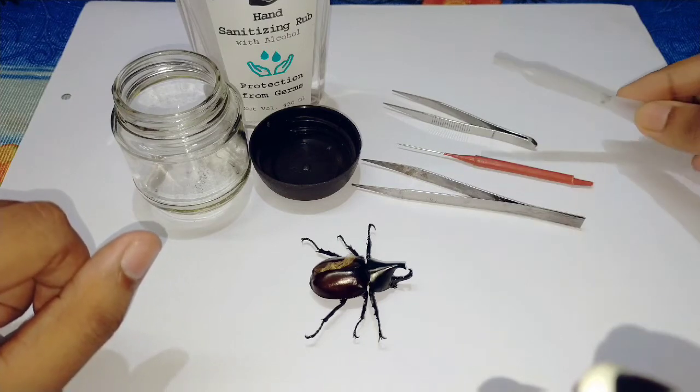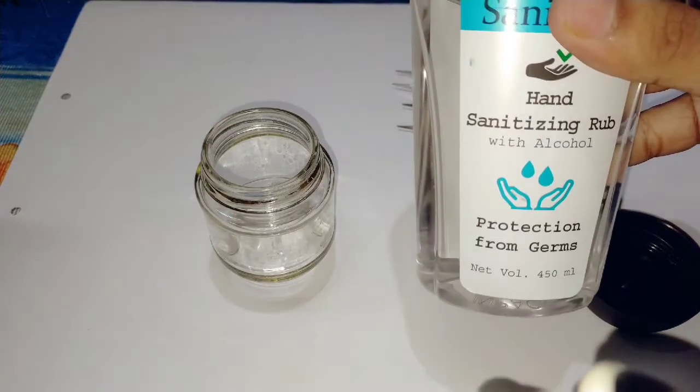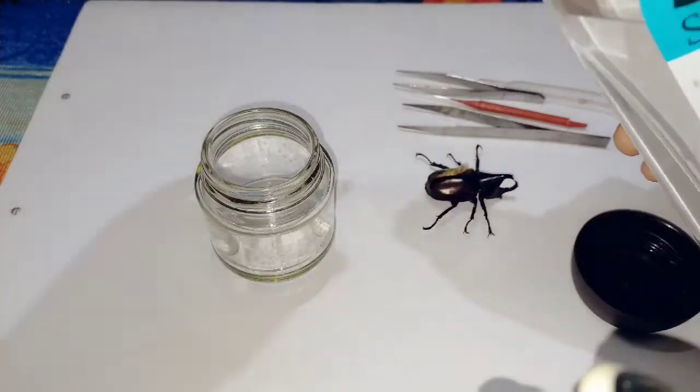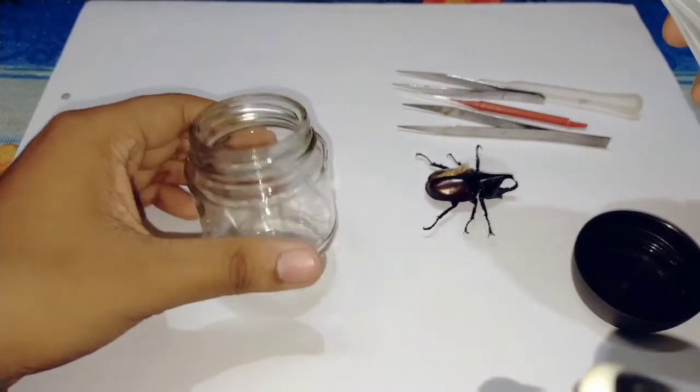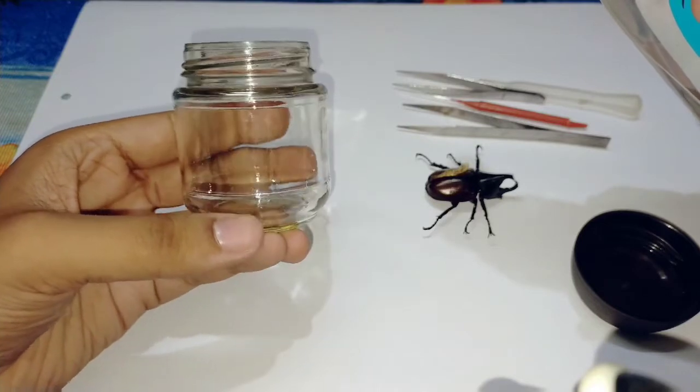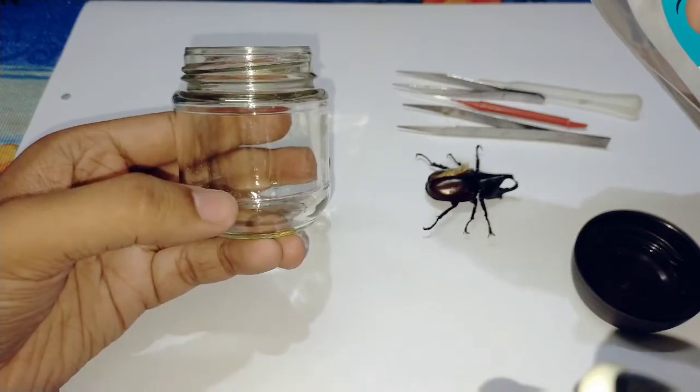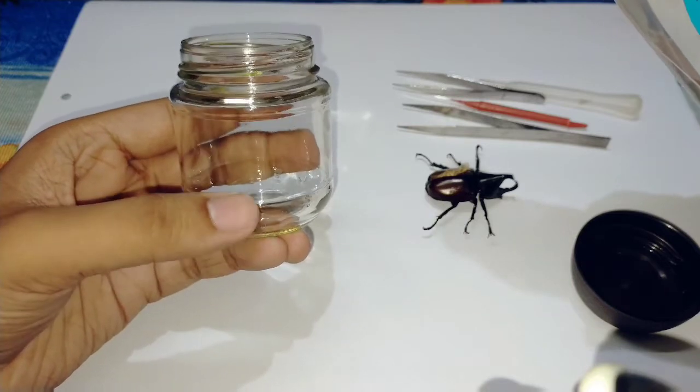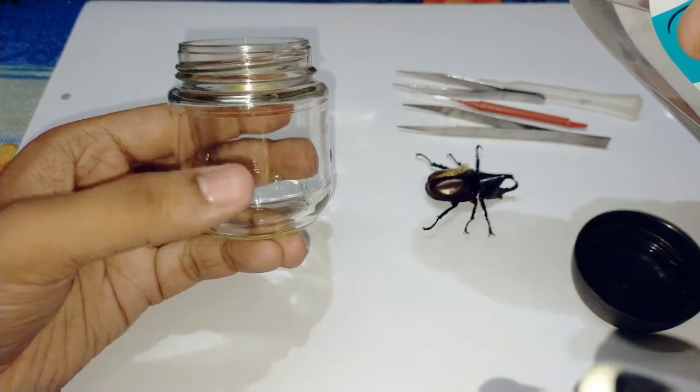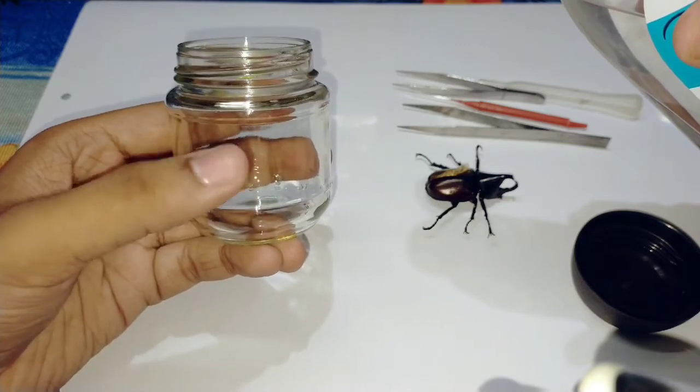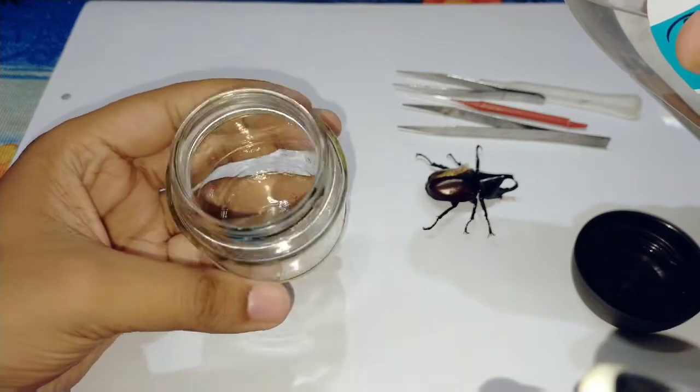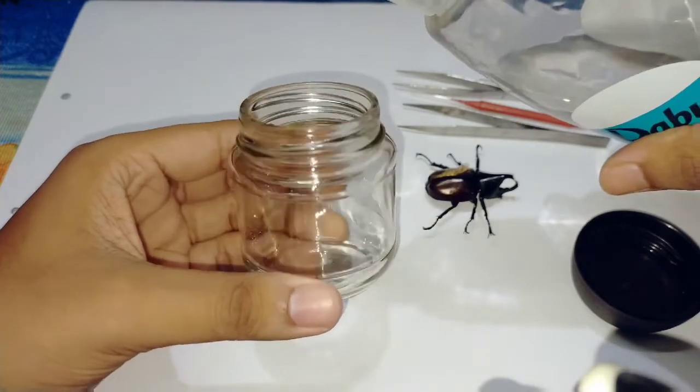First, you take the hand sanitizer, any brand or any company. You should fill the container with sanitizer up to half of it, so that it can keep the insect in the middle of the container and you can observe easily. So let's pour the sanitizer in this container.